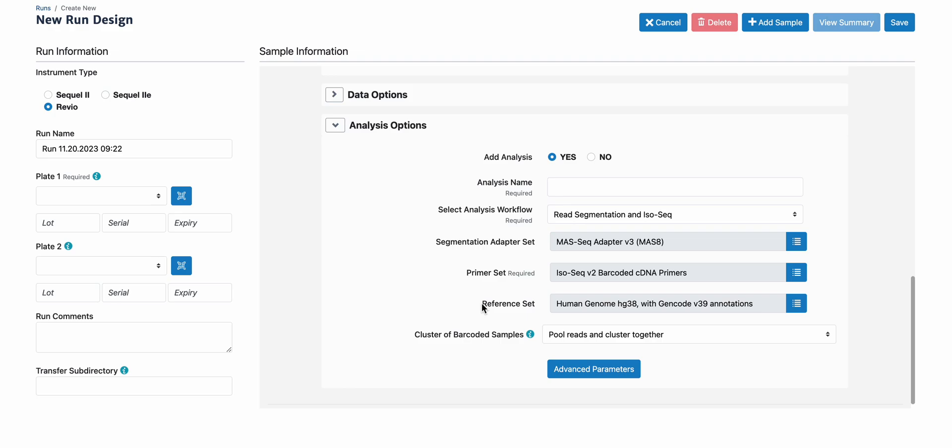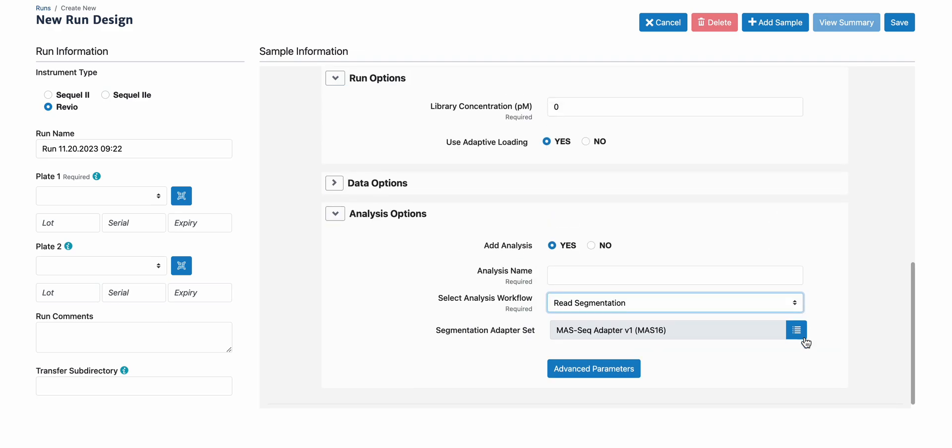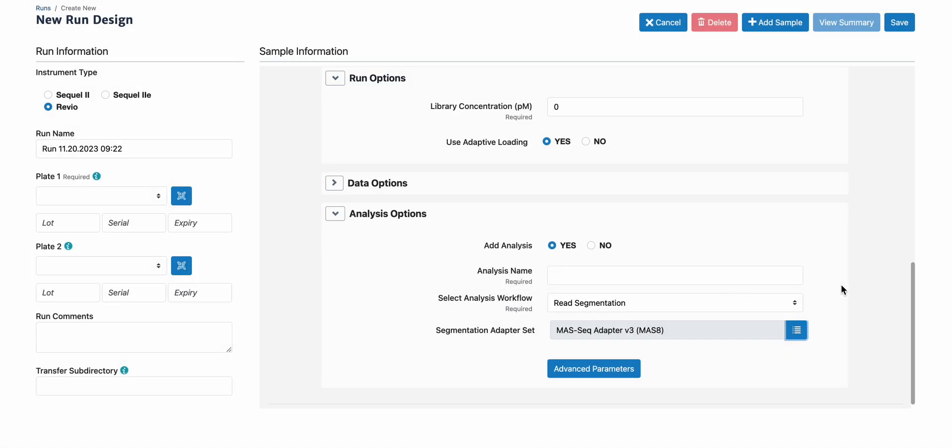The two supported reference sets for analysis are human and mouse. If you have samples that are neither human nor mouse, you can select just resegmentation. We do have to go and pick the right segmentation adapter set, which is Moss 8. This auto-analysis will generate segmented reads, which you can then select for secondary analysis in SmartLink, which would be the ISO-Seq workflow.